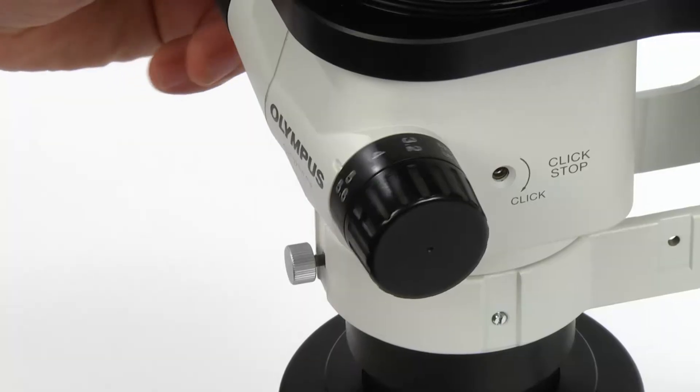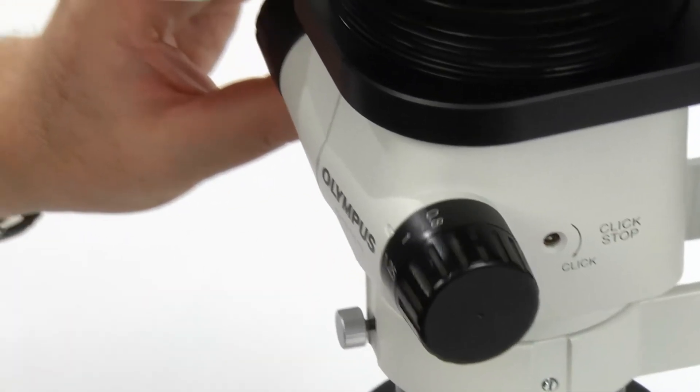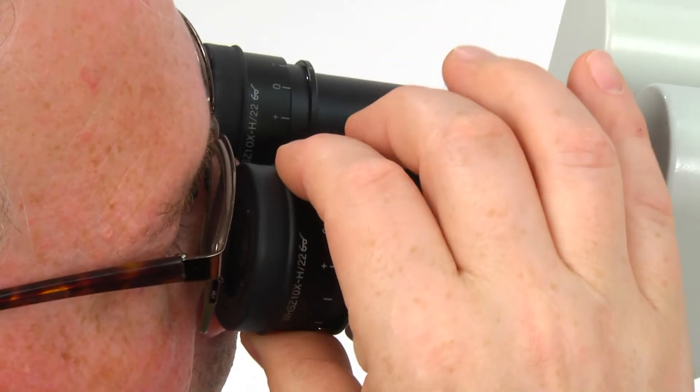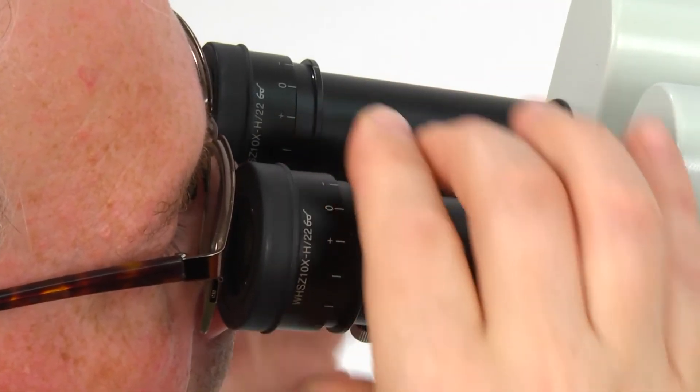Finally, set the zoom adjustment knob for the lowest magnification and rotate the diopter adjustment ring of the left and right eyepieces to bring the sample into focus.